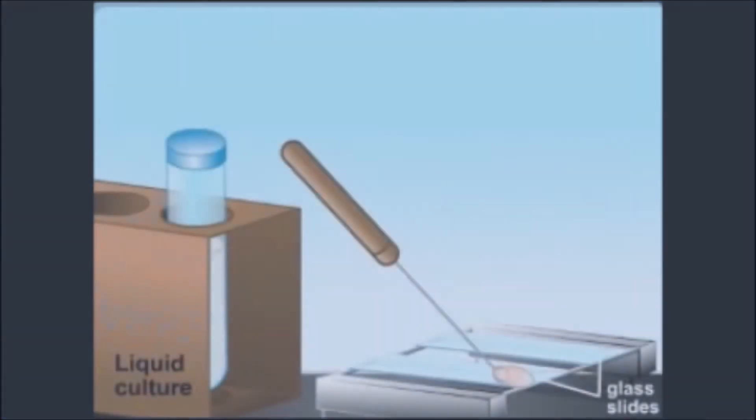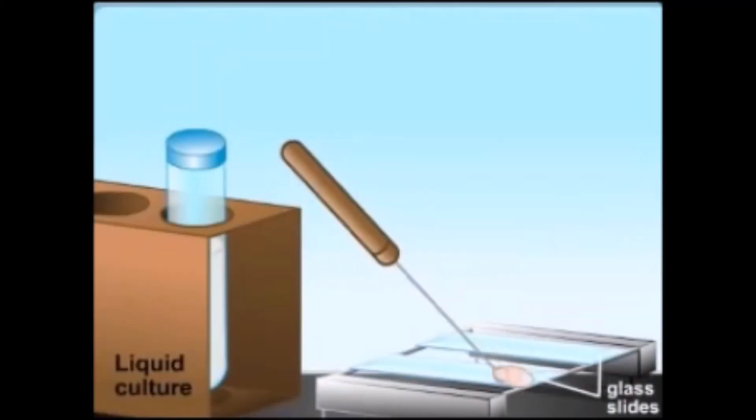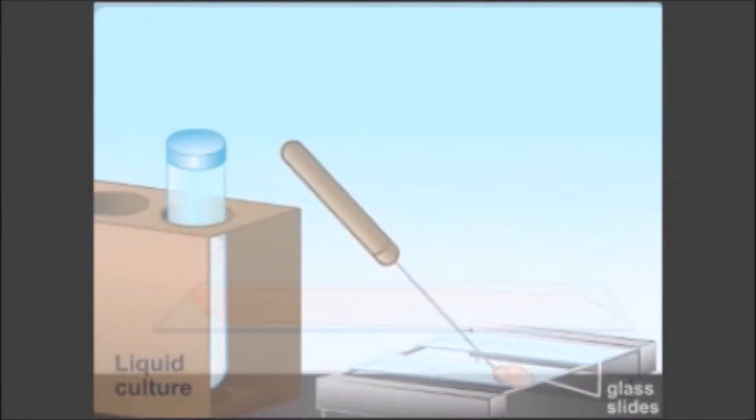Transfer a drop of the suspended culture to be examined on a slide with an inoculation loop. If the culture is to be taken from a petri dish or slant culture tube, first add a drop or a few loopfuls of water on the slide and aseptically transfer a minute amount of a colony. Spread the culture with an inoculation loop to an even thin film over a circle of 1.5 centimeters in diameter, approximately the size of a dime.